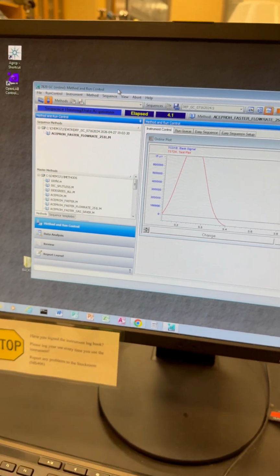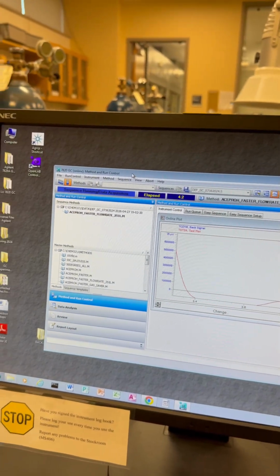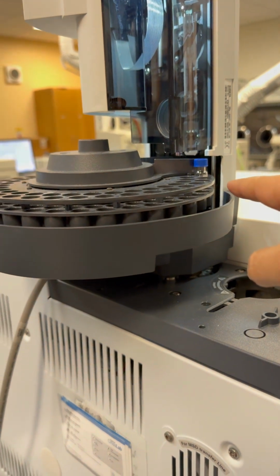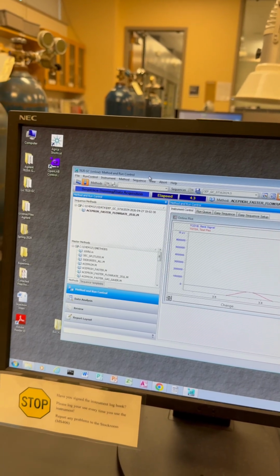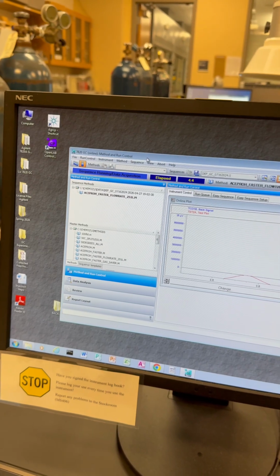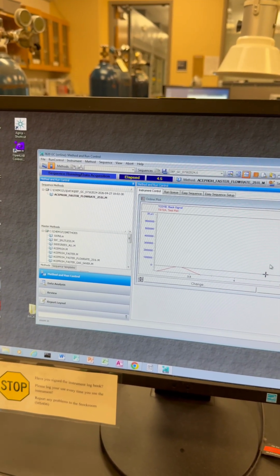The last one would be the temperature gradient that we're going to do. That would be only 1 sample. So you're going to do first 1 sample in different flow rates, then you do 9 samples, and then it takes time. For sure about 5 to 10 minutes is going to be each run. So you're going to wait until the printer comes out. You're going to also see the online signal.